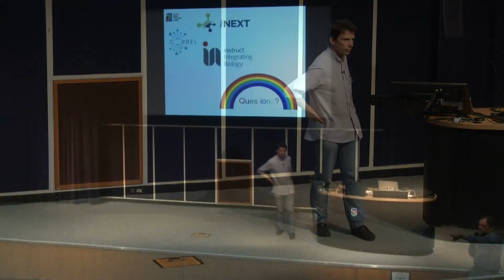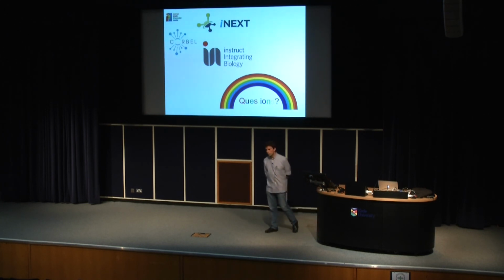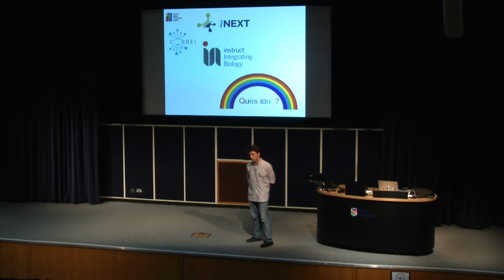Hey, Tom, this one. Thanks. It strikes me that Scipion can do some really handy things. One that springs to mind is looking up particle coordinates from a set of particles in, say, a class, and going to look at where they are in the micrograph. A lot of people have their own hacked scripts for that. I haven't found a tutorial for Scipion, but is a sort of revamped tutorial something you might look at producing?